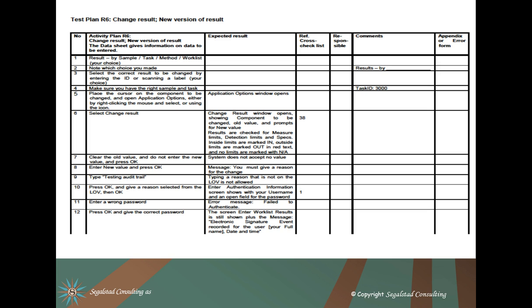This is just a few lines of real test plan, so you can see how I like to write the test plan. However, it's perfectly okay for you to do it totally differently. This contains a column with a reference. It has a column with what to do, a column for expected results. It has room for comments and links to additional documentation.